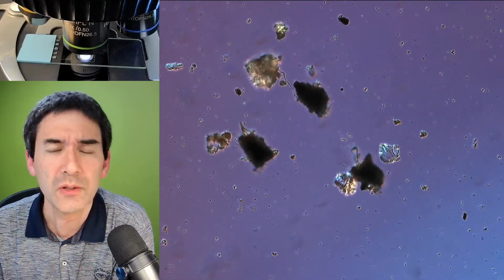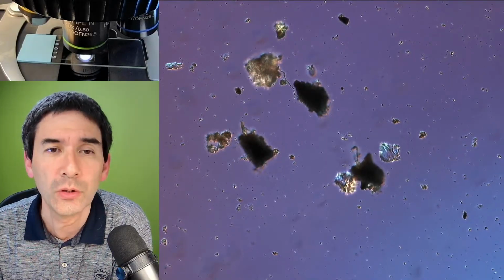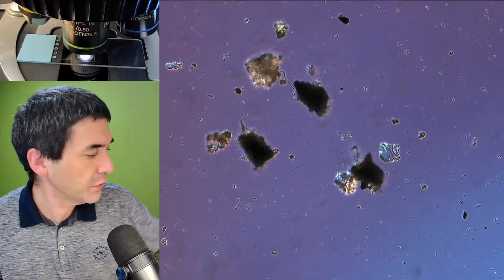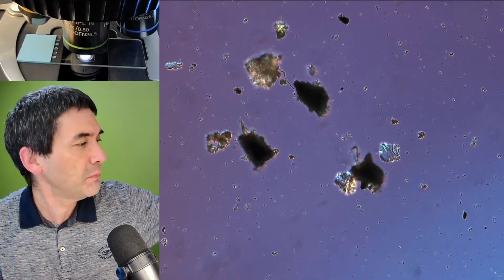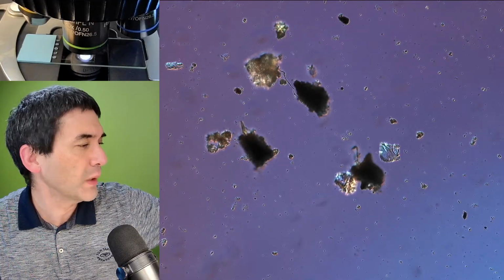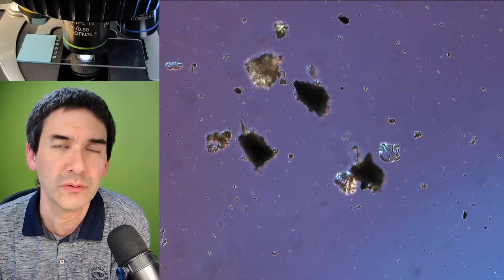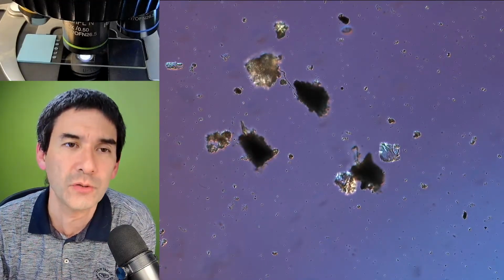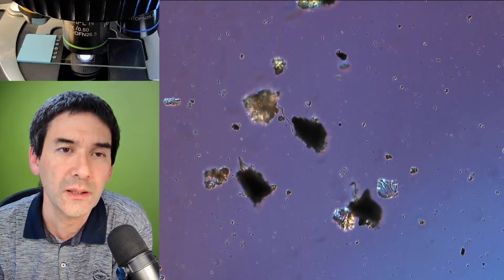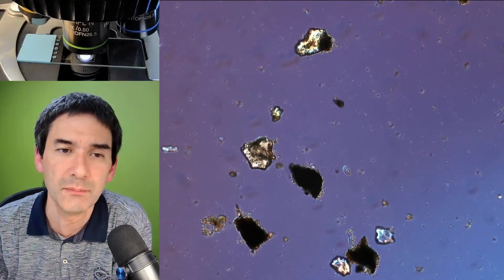Well, of course not, because it's full of fungi and spores and bacteria, but not all of them actually move. And in your comment that you mentioned, you have seen some dead ones as well. Under the microscope, you don't really know if an organism is dead or not. Just because it's not moving does not mean that it's actually dead. So sometimes it's simply difficult to see. So what I usually do then is switch over to phase contrast.